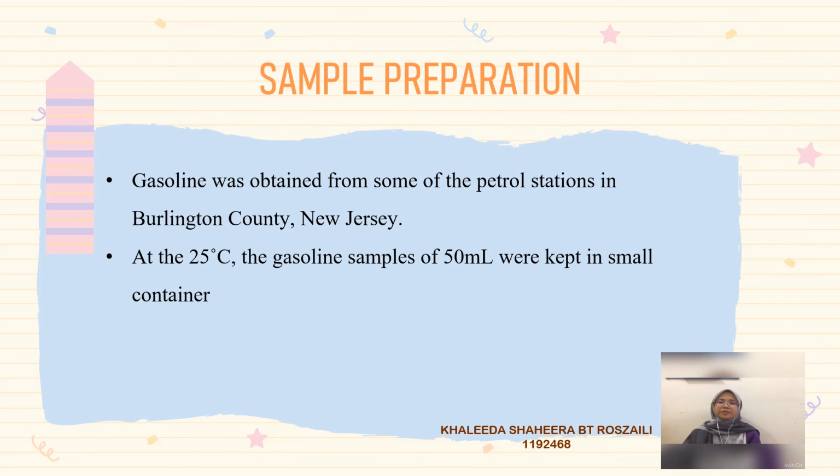For the sample preparation, gasoline was obtained from some of the petrol stations in Burlington County, New Jersey. At 25 degrees Celsius, the gasoline samples of 50 ml were kept in a small container. Since gasoline is very flammable, we must use personal protective equipment during the experiment.